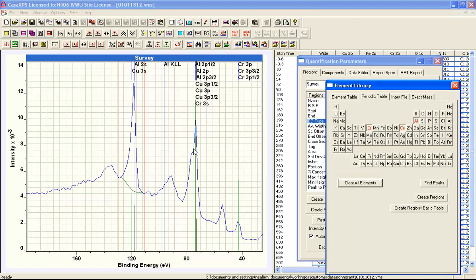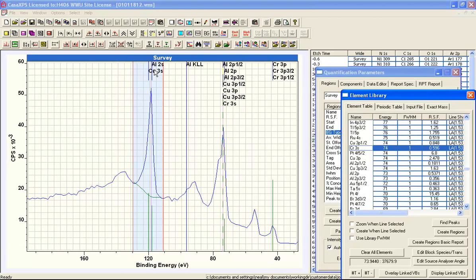The only course we can follow is to use the information about aluminium and copper in the aluminium 2s / copper 3s interval, and identify signal that we can feed back into a quantification based on the survey spectrum. Low-resolution survey data does not allow us to separate copper from aluminium in this interval, so we need to consider a high-resolution spectrum.